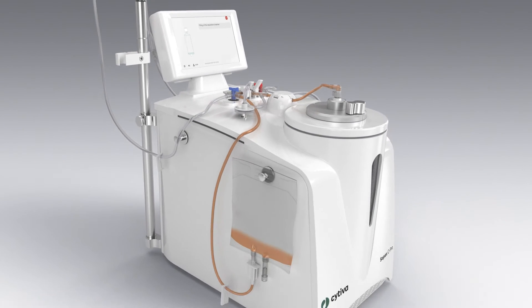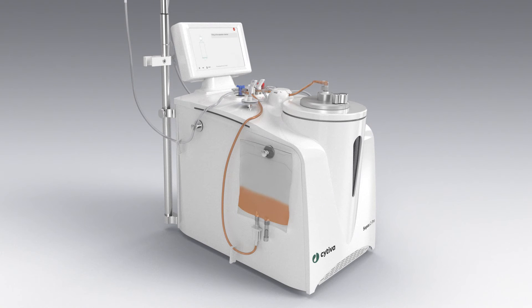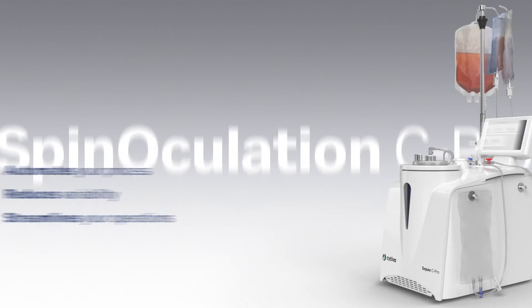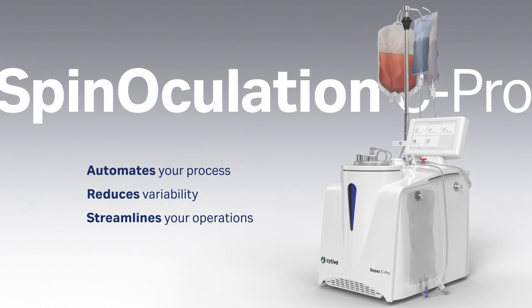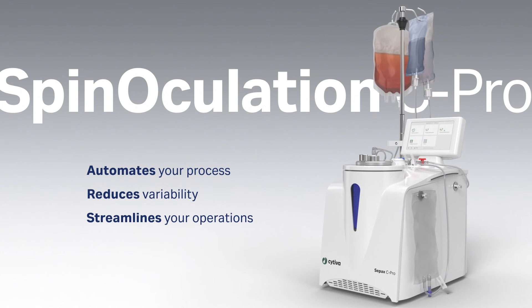Then the system extracts the transduced cells into a final bag, where you can re-suspend them to reach the final volume you need. Spinoculation C-Pro application with CPAC C-Pro instrument automates your viral vector transduction process.